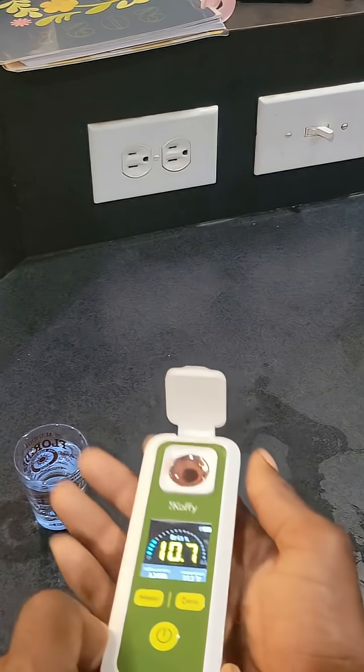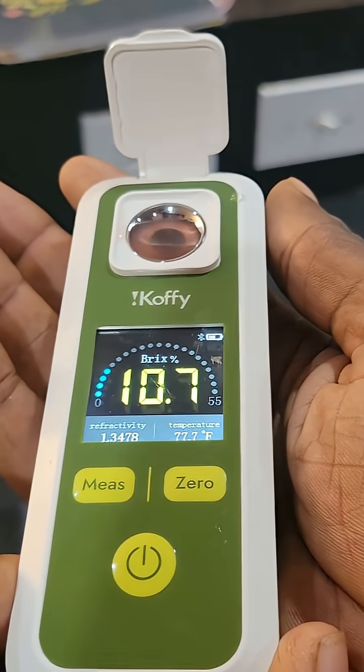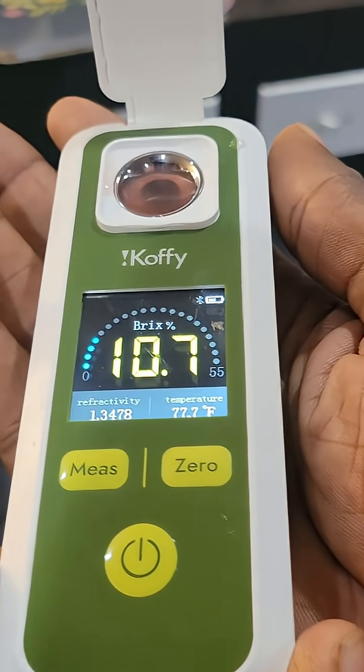It measures 10.7 Brix, and when you connect the app to your phone you can collect more data and get more information.